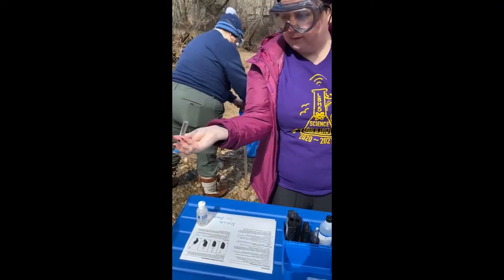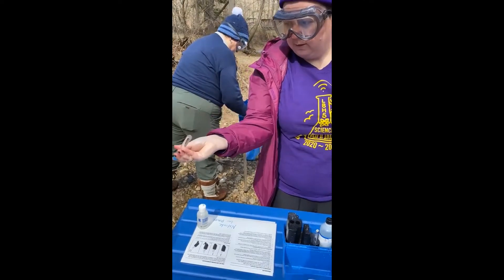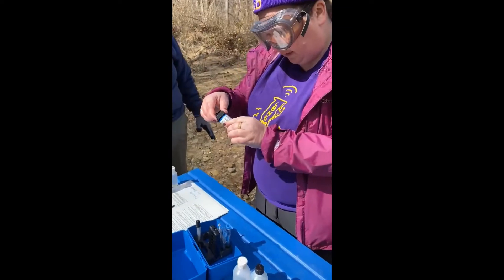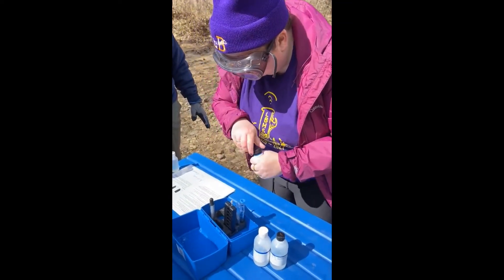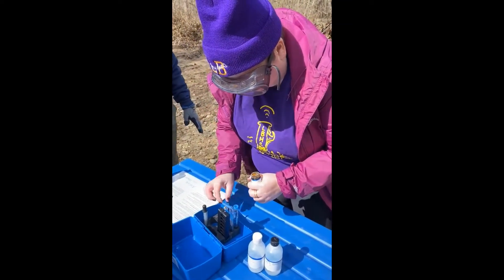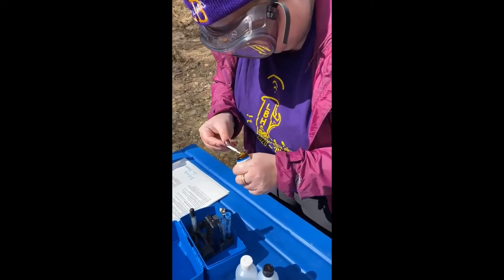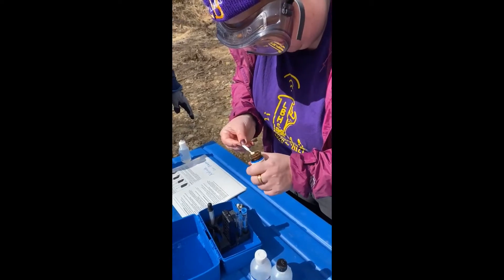Cap and mix. We've let our sample sit for two minutes and now we're going to add in our nitrate reducing agent. One scoop — smells strong.